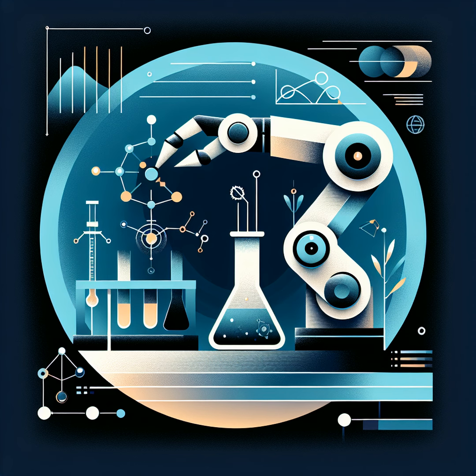The paper highlights several key technologies that make SDLs possible. We're talking about advanced robotics for precise manipulation of materials, sophisticated AI algorithms for experiment design and data analysis, and powerful machine learning models for identifying patterns and making predictions. It's a truly impressive blend of engineering and artificial intelligence.